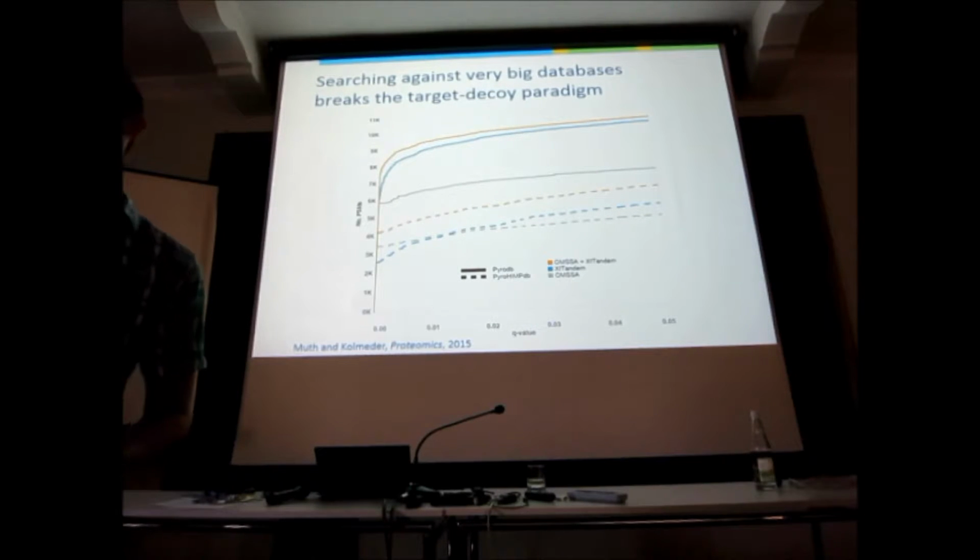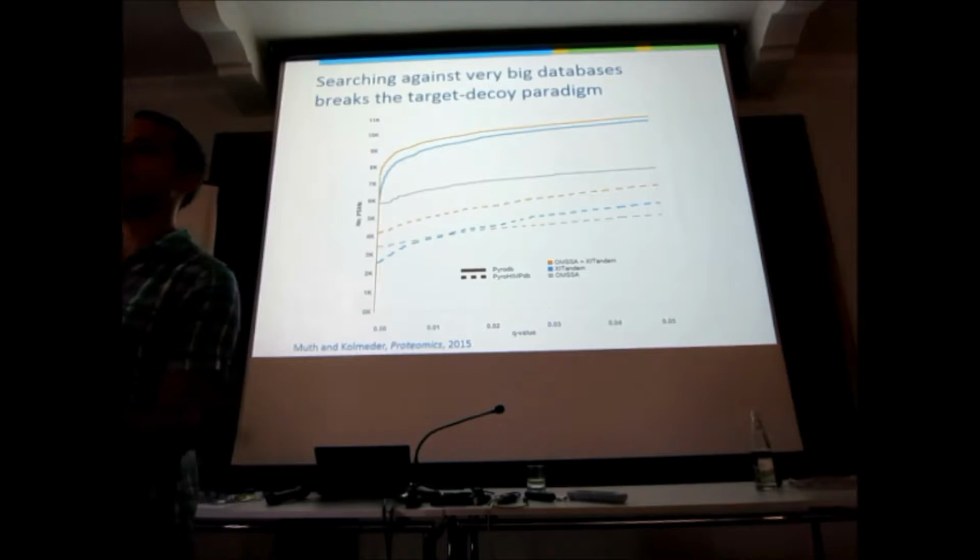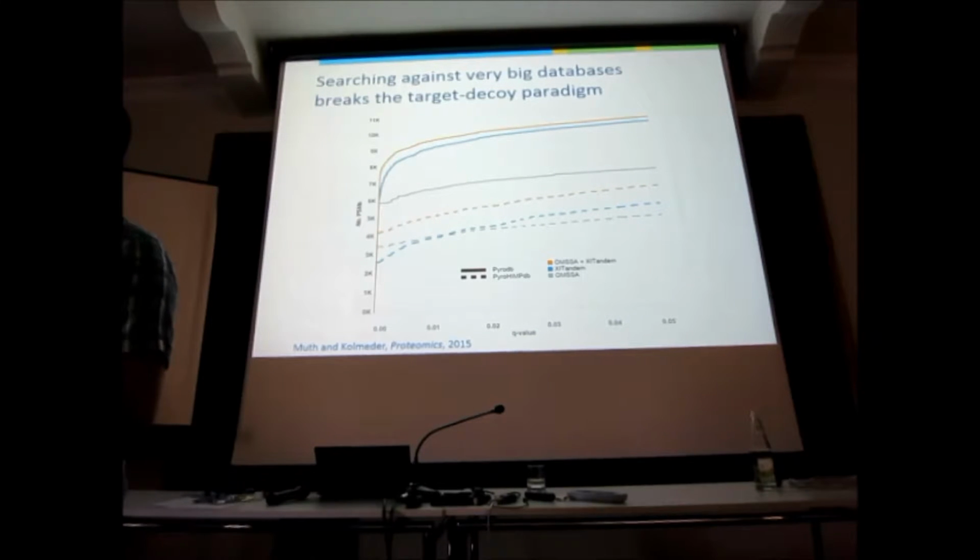So take home message number 1. Search engine behavior depends on the size of the database. In general. The big exception is MSGF+.